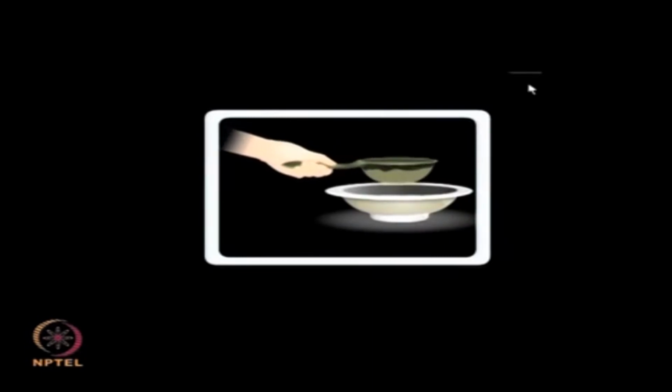Let me give you an analogy of gel filtration with a sieve. This process is very similar to the separation of small particulate matter from food grains using a sieve. The larger grains remain behind the sieve, while the smaller sand or stone particles pass through and are removed. In keeping with this, the gel filtration technique is also commonly referred to as molecular sieve.